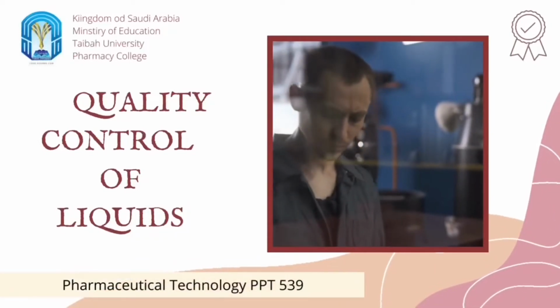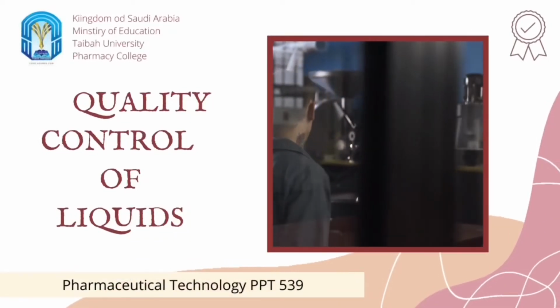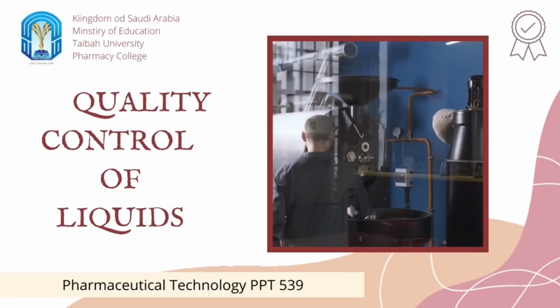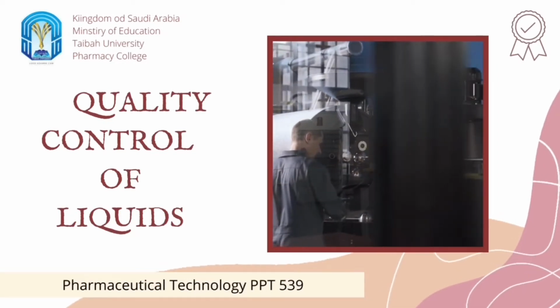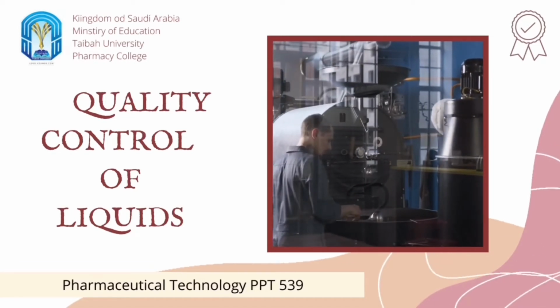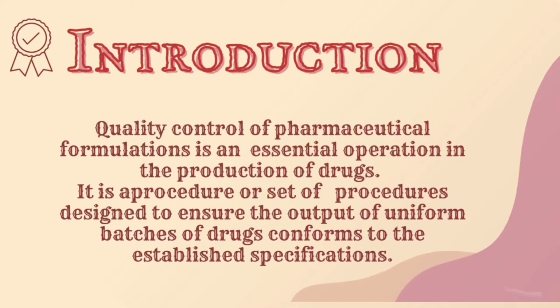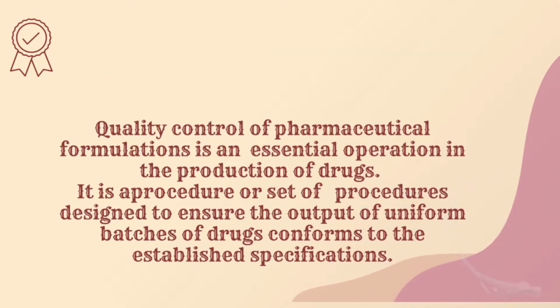Quality control is an essential operation in the pharmaceutical industry, and in this video, as a part of our pharmaceutical technology project, we will discuss quality control of the liquid dosage forms. Let's start with the definition of quality control. Quality control is a procedure or a set of procedures that are designed to ensure the output of uniform batches of the drug conforms to the established specifications of these formulations.